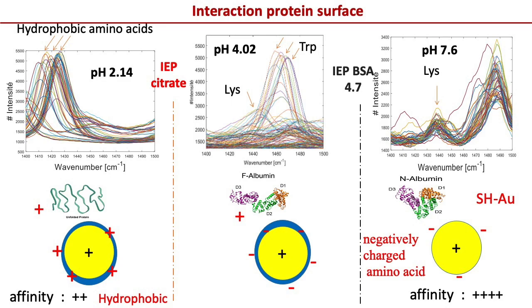The situation is similar at the lowest pH. The protein is electrostatically repelled by citrate. We saw that the thiol bond was less active. The protein being denatured, it becomes hydrophobic and it prefers the gold surface rather than remaining in solution.